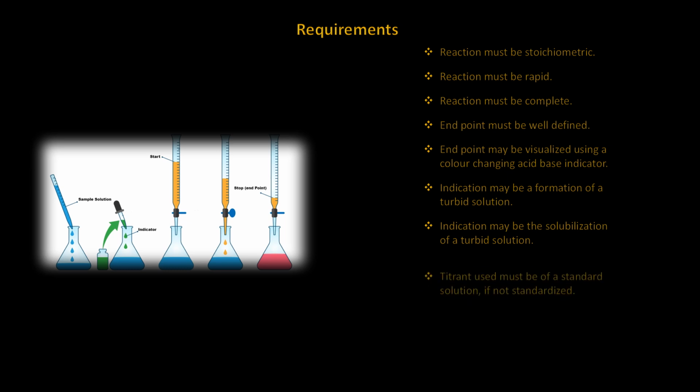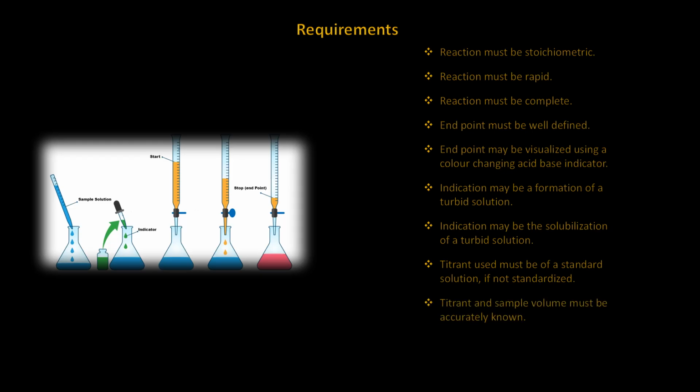Any titrant used must be a standard. If it isn't a standard solution, then it must be standardized for a true and accurate concentration. The titrant and the sample solution volumes must be accurately known. The actual reaction that takes place must have a definite chemistry with no side effects, no contamination or multi-precipitative characteristics. The reaction must be totally selective. If these requirements are not met, your analysis will not be accurate, and therefore totally useless.